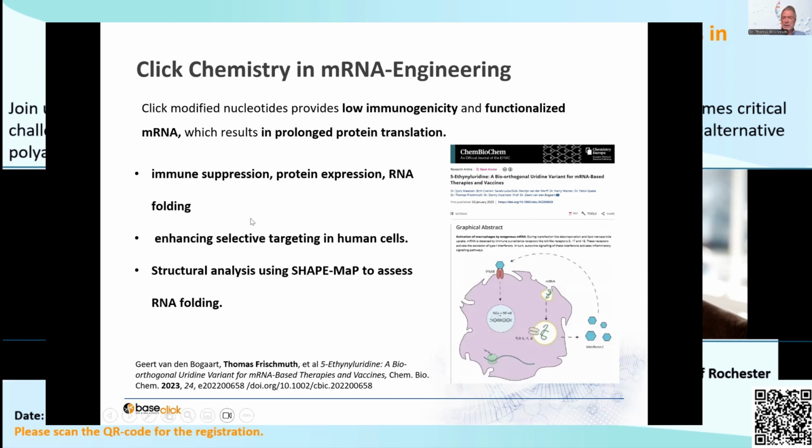And also, as was published recently by our group, we were able to introduce click chemistry in mRNA engineering.